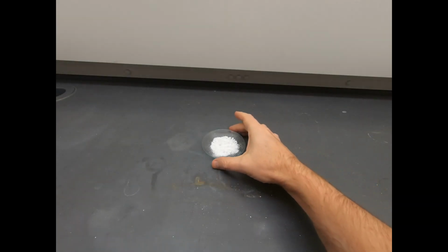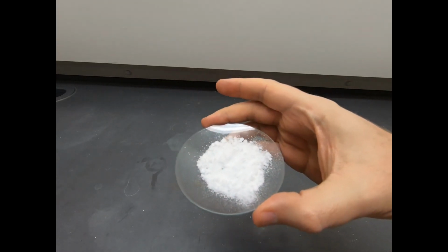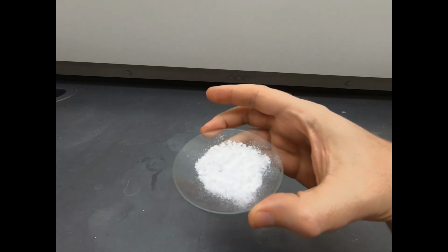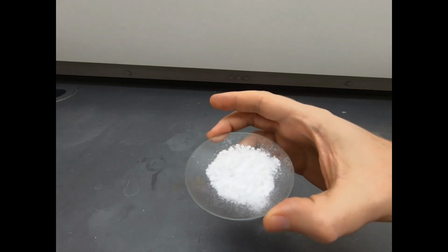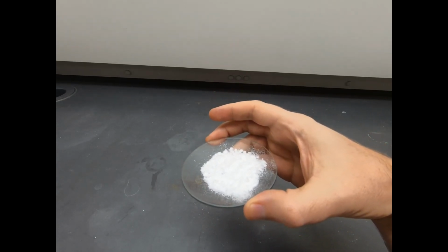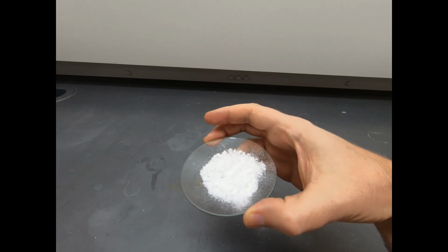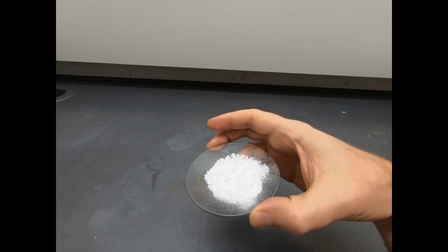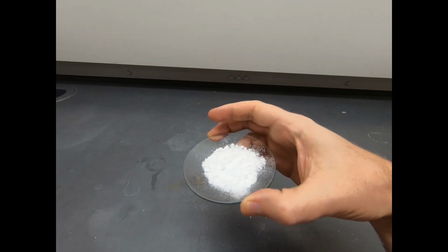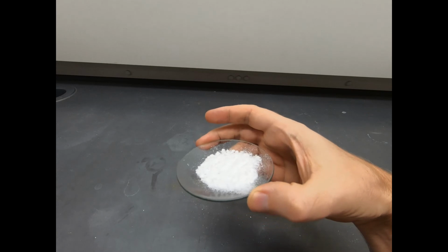Alright, so here we are. We have this solid. This is the final solid. This has been allowed to air dry, and the mass of this solid, not including the watch glass, is about 2.37 grams. Now 2.37 grams is not fantastic. I think the amount of aspirin in those 30 pills was just under 10 grams. So 2.37 out of 10, that's in the 20 to 25% recovery range. Not great, but still, this is now recovered aspirin.